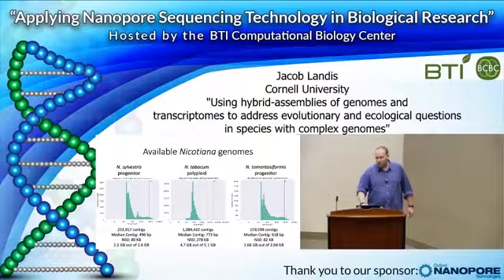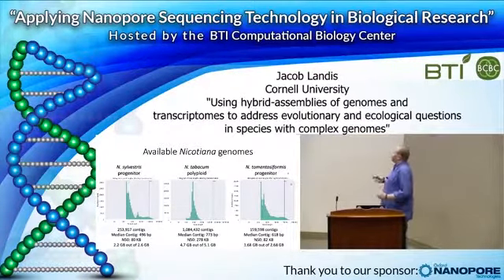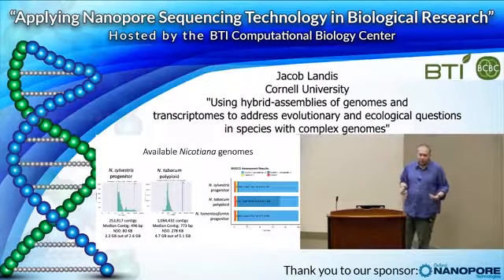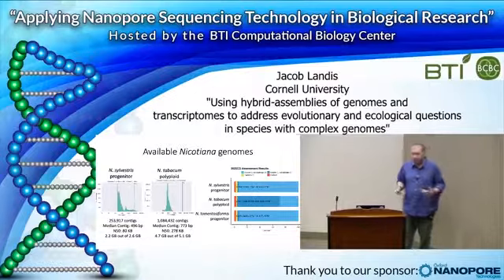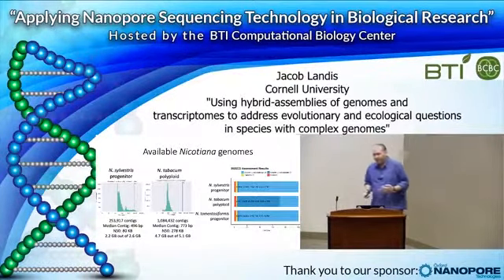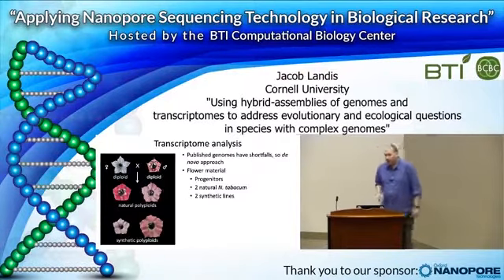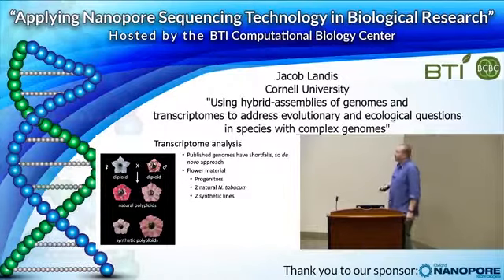So even though a lot of the genome is missing, if you look at the BUSCO genes for just things in the Solanaceae, you do see that these genomes encompass most of those single-copy nuclear genes that you should have there. We do see, though, that in the polyploids, even though they should all be duplicated, not all the genes are. So that does lead to some problems with trying to map back RNA-seq data. Now, we did try to use these genomes to do that, but we had very bad success with that. And so we are looking at RNA-seq for this study with the progenitors, natural, and synthetic polyploids.